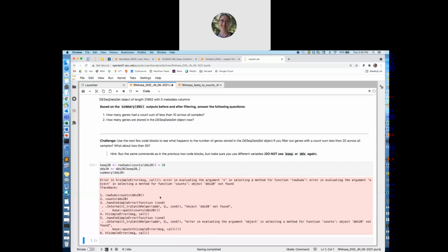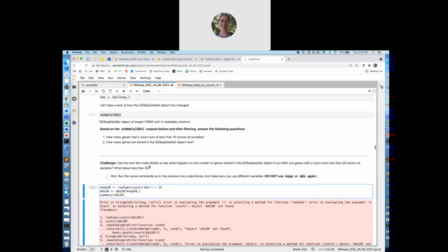That's right. The very first time you call DDS, you're calling the original DDS, and you're subsetting the original DDS. So I'm sorry, I misspoke earlier.